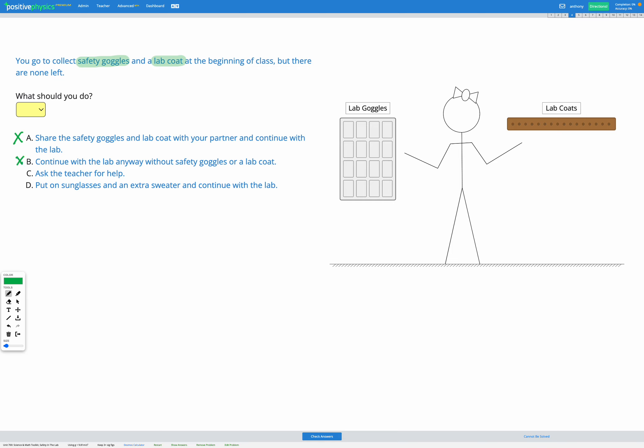C says ask the teacher for help. This sounds like a good option because maybe there's another room with extra safety goggles or an extra lab coat. Maybe the teacher can provide you with their goggles and their lab coat. Or maybe the teacher doesn't know that there aren't enough lab coats and lab goggles and they need to purchase more for the classroom.